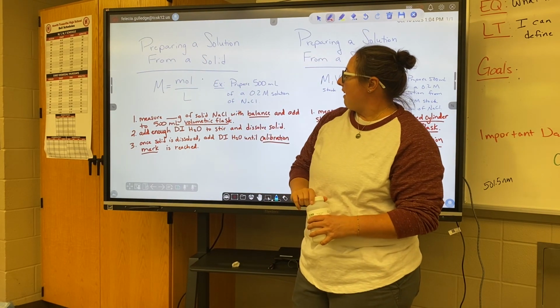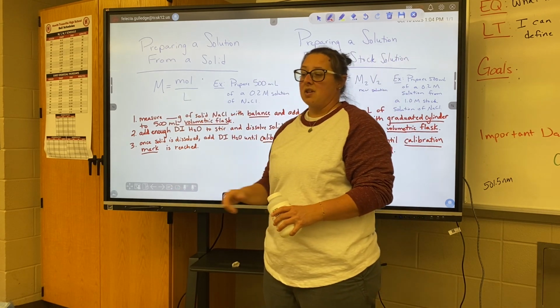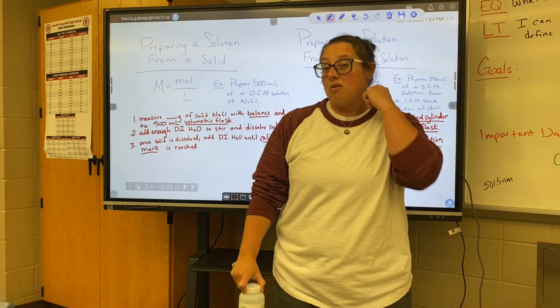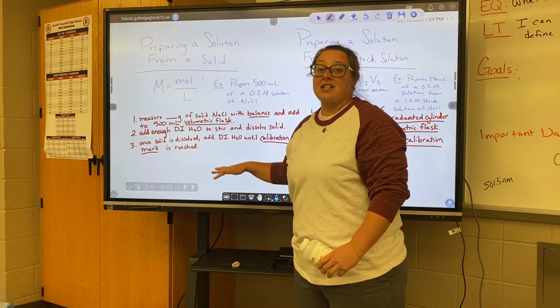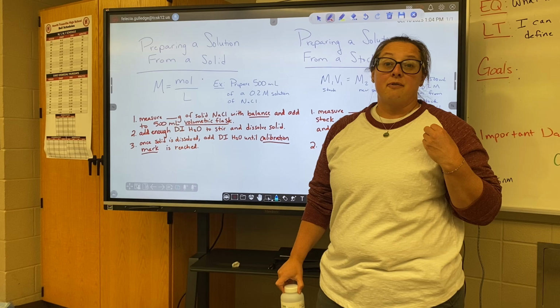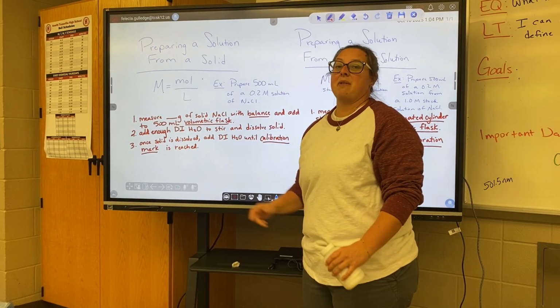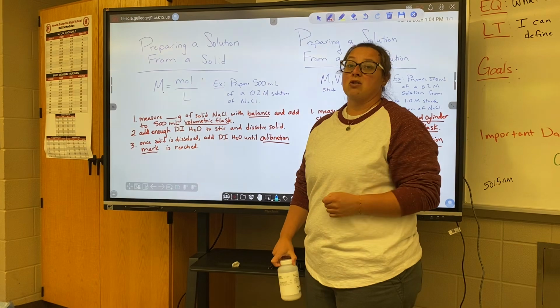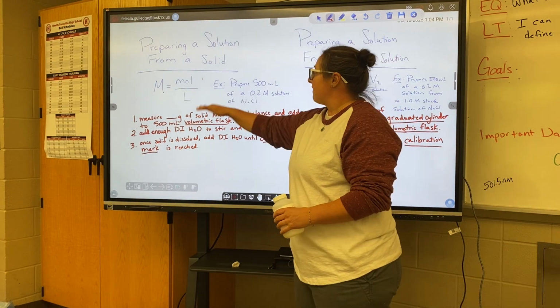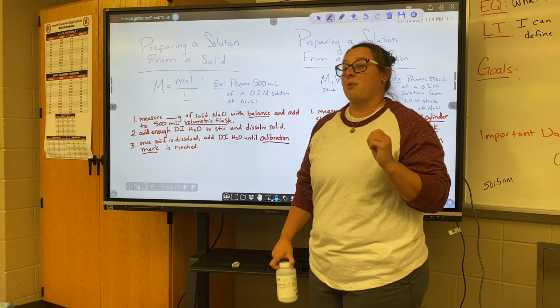After we figure out how many grams we have, we then follow these steps. Now, something very important to note, I want to make sure that you do write this down in your notes, because they love to ask this on the AP for your response portion, where they want you to list every single step that you need to do to prepare a solution. So I put every step, especially those things that are underlined, we need to make sure that we have.